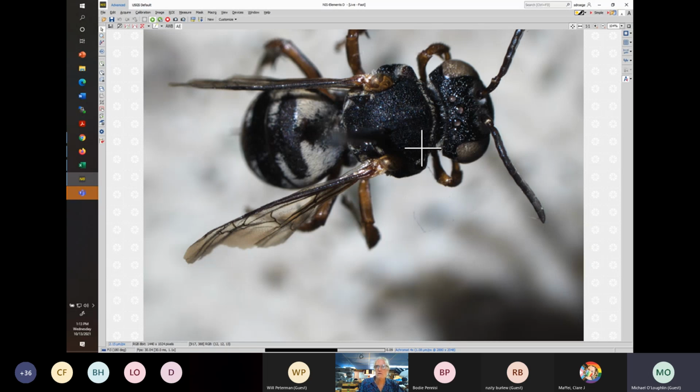There are little patches left over, but just be aware that the state of your specimen has an impact, particularly on specimens with low hairs, because almost always when a set of hairs are gooped up, they dry and turn dark. So even white hairs will be dark because of the goopiness.